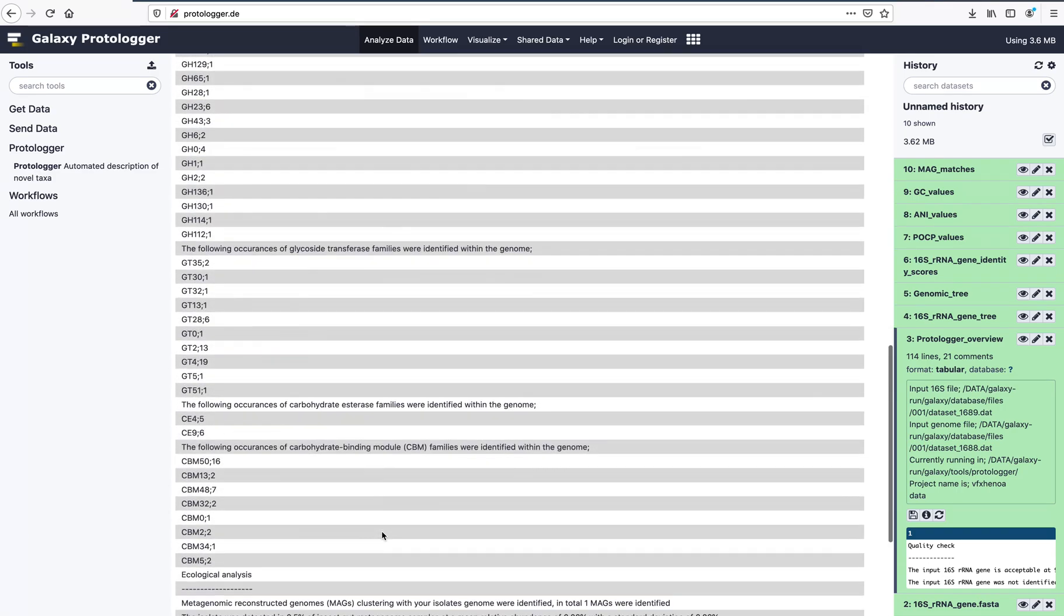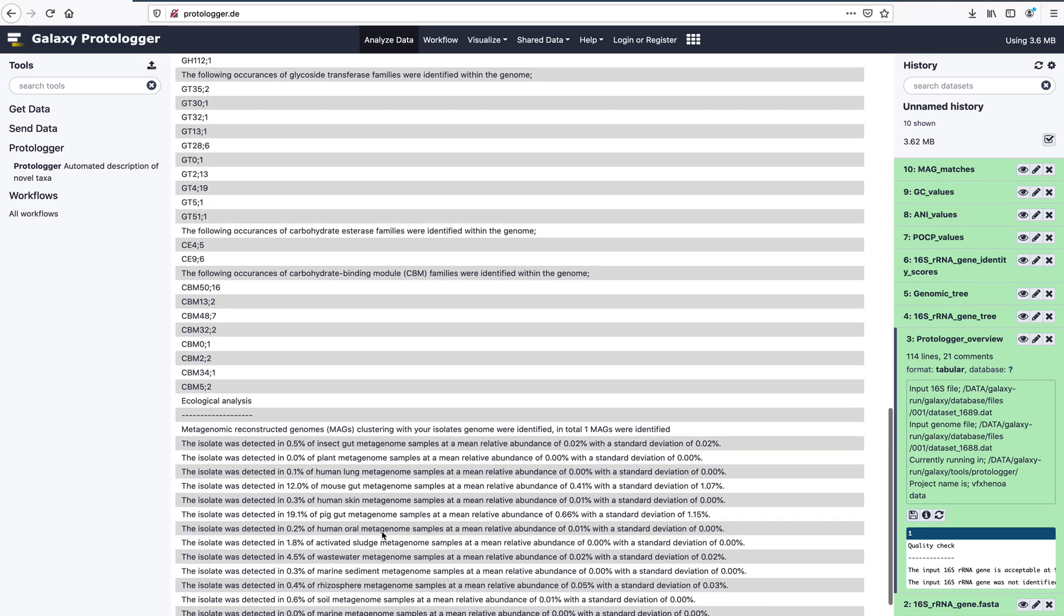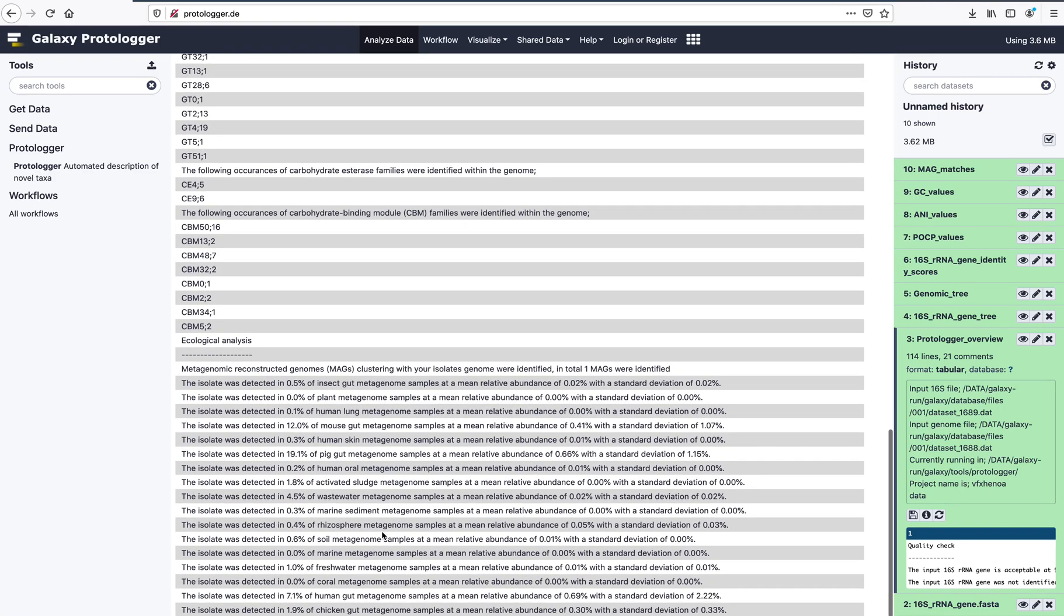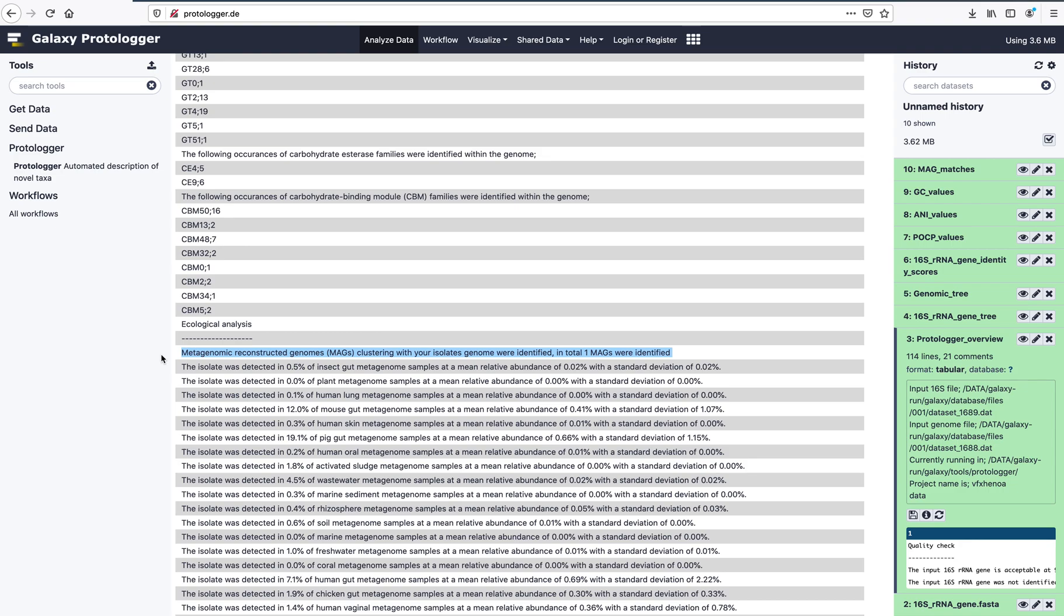The ecological analysis consists of two parts. The first is a comparison against metagenomically reconstructed genomes, and the second is an environmental survey. In this example, a single reconstructed MAG has been identified to match the input genome. We will look into this further in the MAG matches output file.